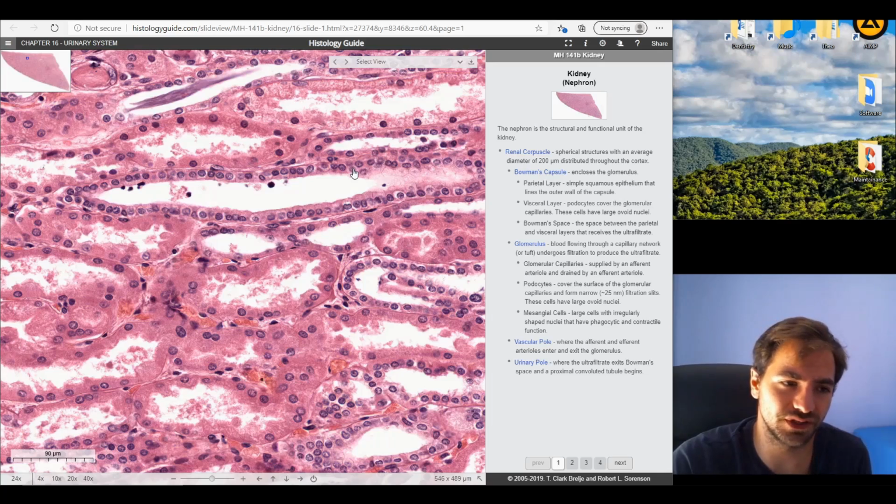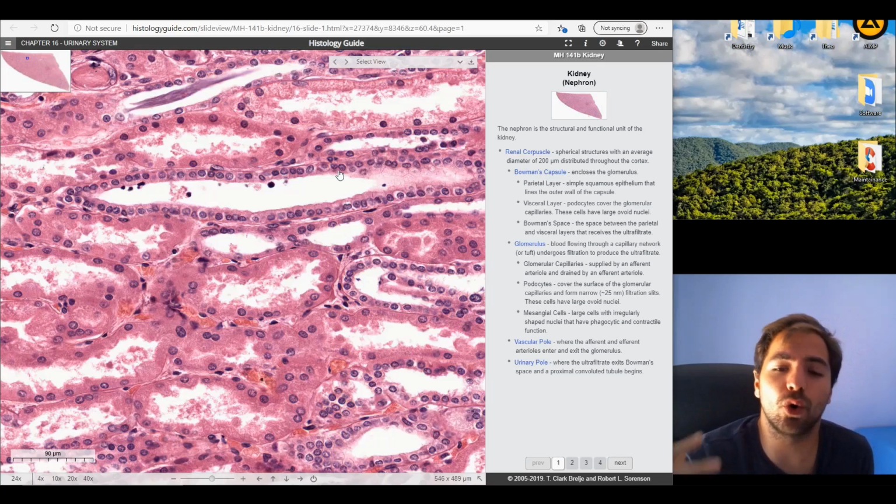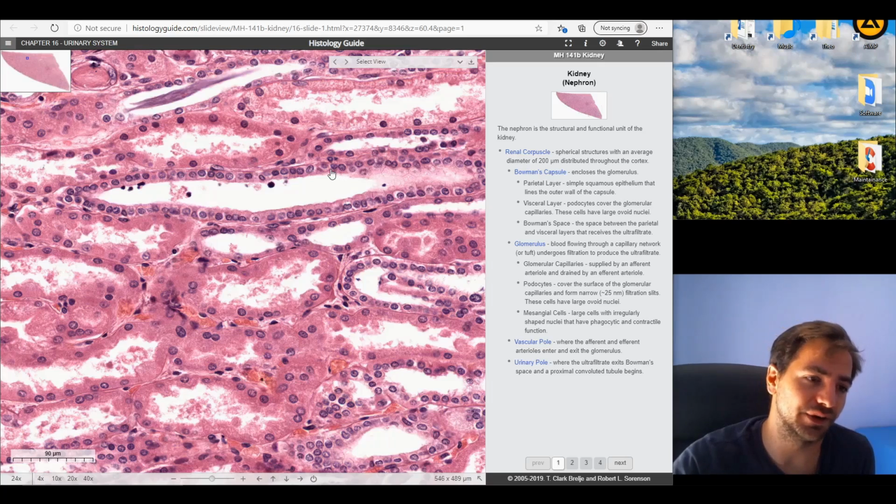Most of the population of these cells are the principal cells that react to aldosterone and this whole structure of the aquaporins, and are the hormonally sensitive and affected areas in these cases. So exactly, this is the structure that we should find, and it should look like the collecting duct.